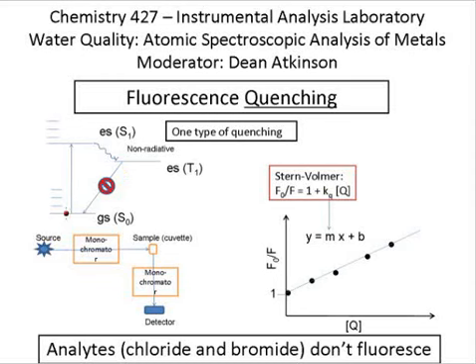So here's our diagram that shows the ground state and the excited state of that molecule. Again, we labeled those S0 and S1. S in that context stood for singlet, which meant all the electrons in that molecule were paired up. And so we showed photons taking a molecule from the ground state to the excited state. We also drew on the other cartoon photons coming back down from the excited state to the ground state and producing a photon that we could detect in fluorescence.